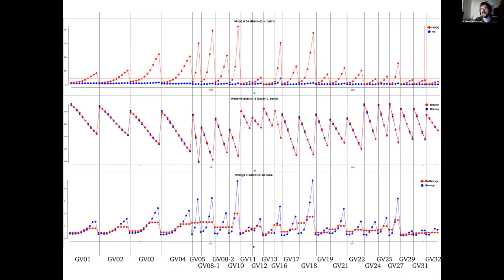At the time that we did this I took hours over it manually exploring different cutoffs with aimless but these days I can get essentially the same quality data set using automatic exclusions built into dial scale using the delta cc half metric.